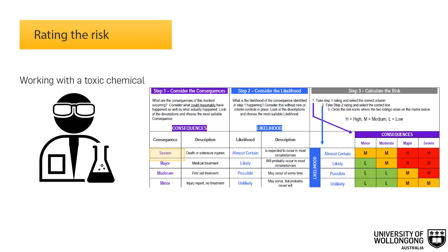Now let's consider the likelihood of this consequence occurring, taking into consideration factors like how much of the chemical is used, what its concentration is, and what controls are in place to prevent contact, such as working only in a fume hood and using personal protective equipment. If we are only using small quantities and working in a fume hood with personal protective equipment and clothing, then the most probable likelihood would be unlikely. Therefore the risk of working with methanol is medium.